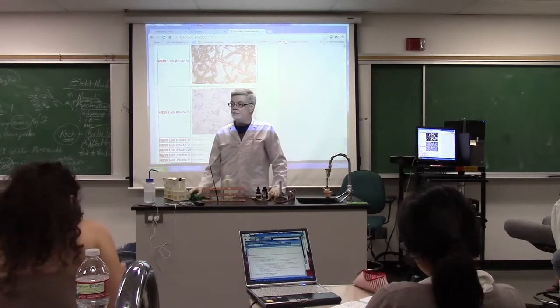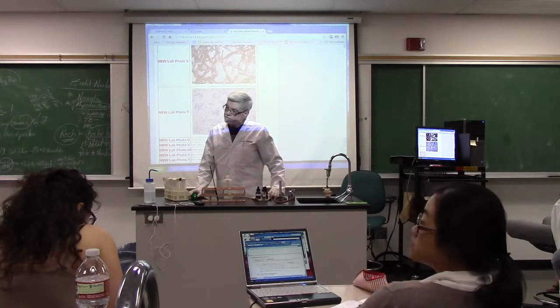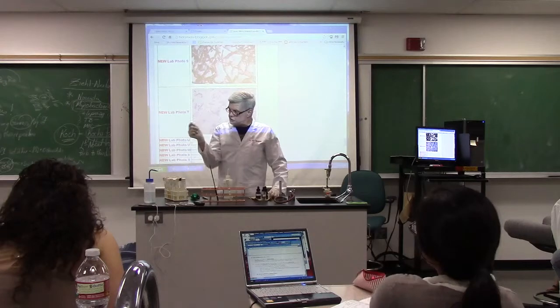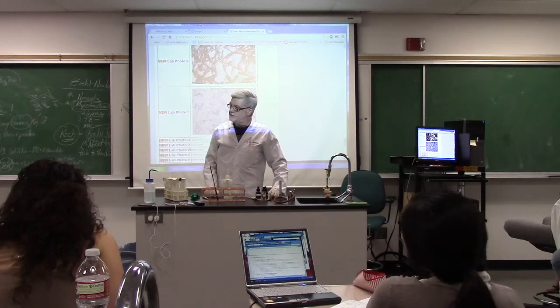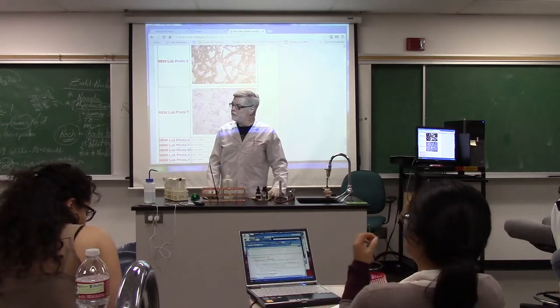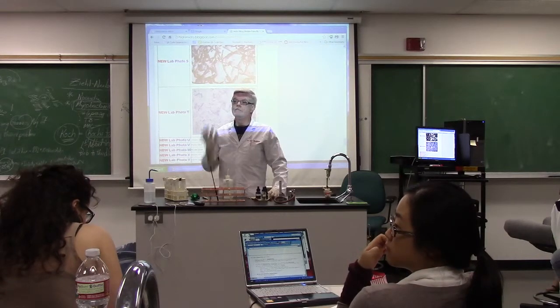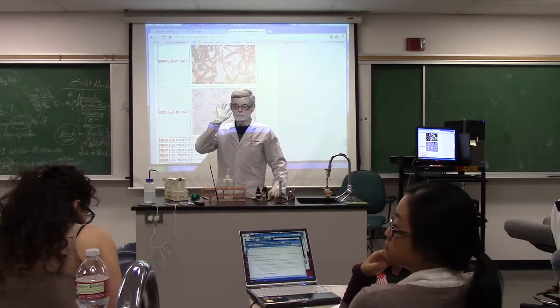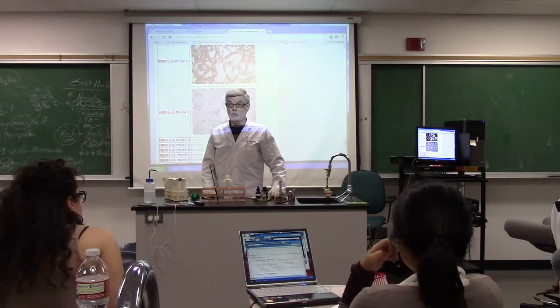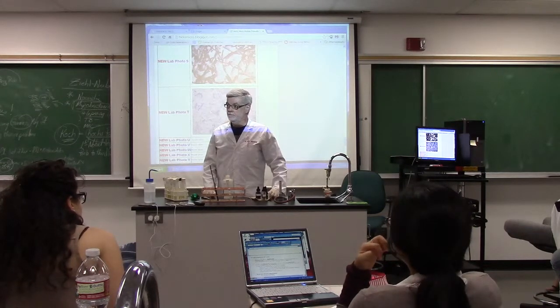Anybody have questions about this process? Anything about it? Yeah? When you made the smear, did you go out the slide? Yeah, I spread it around, but I made sure I stroked some of those clumps right in the circle. Even though after I beat them, you can still see them. They look like little fibers. You had another one? Yeah. Quick question. If the cells are hot pink, it's positive, right? So if you have a hot pink rod, it has to be a rod. If it's a circle, it's overheated. Or it's an endospore. It has to be a rod.